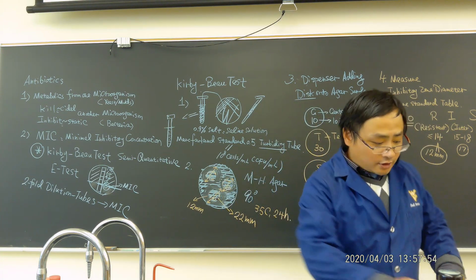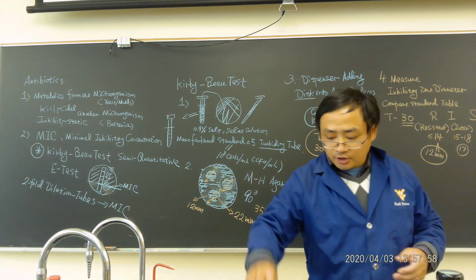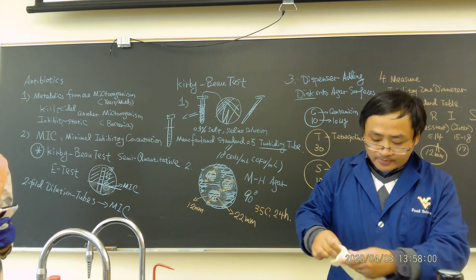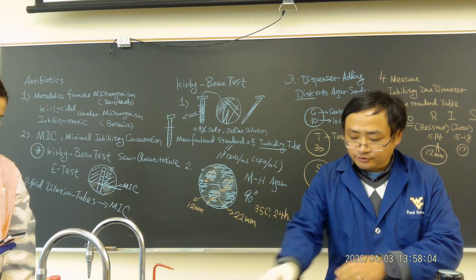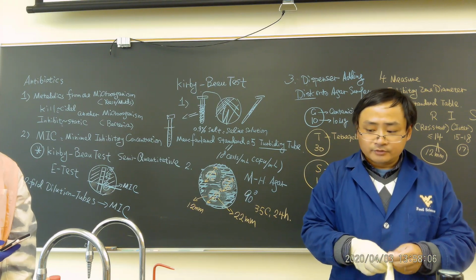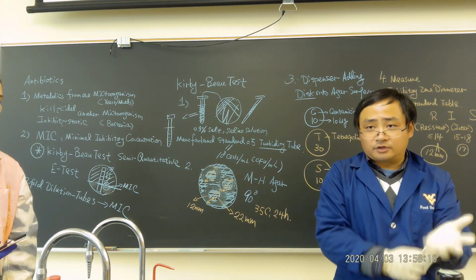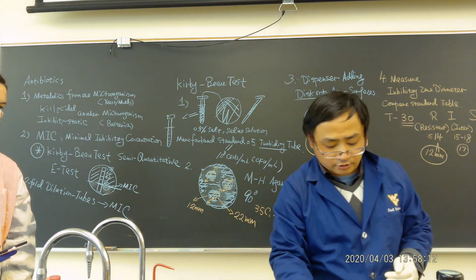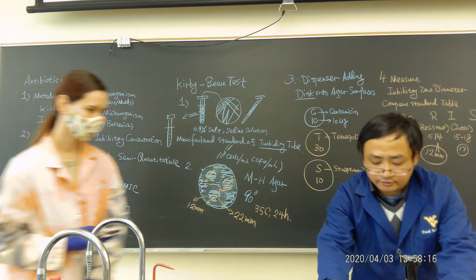Now let's do a demo for you. Karen here will show you how to do it, and I want some of you to come here to do some of the tests. If you're interested, you can do it. So first of all, you can come here and take a picture of this.